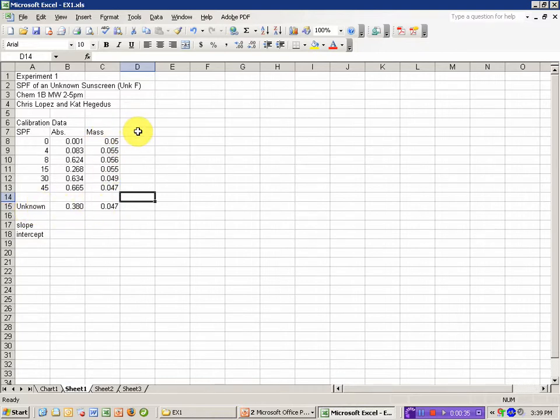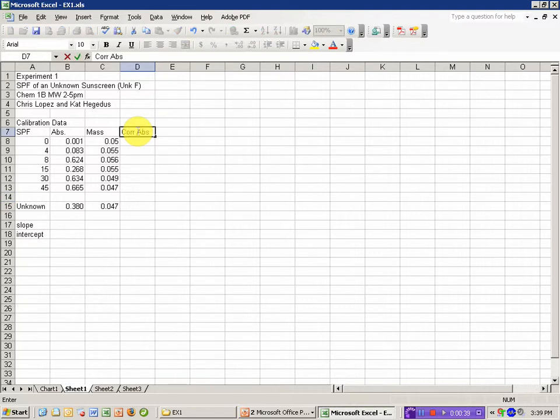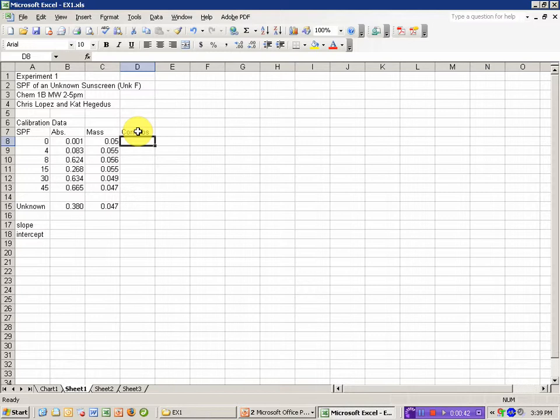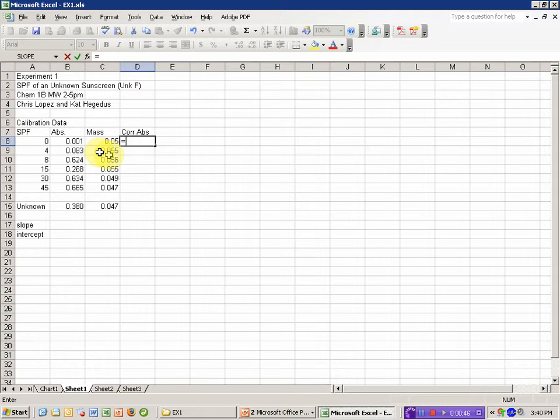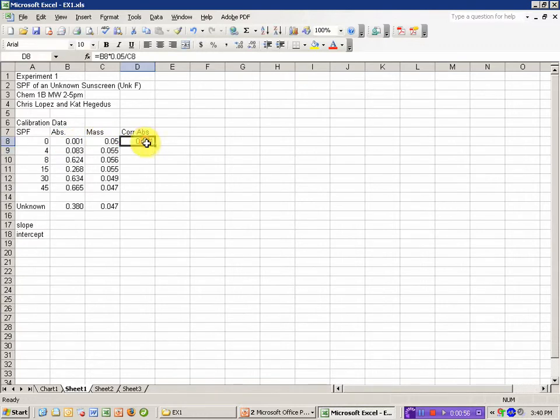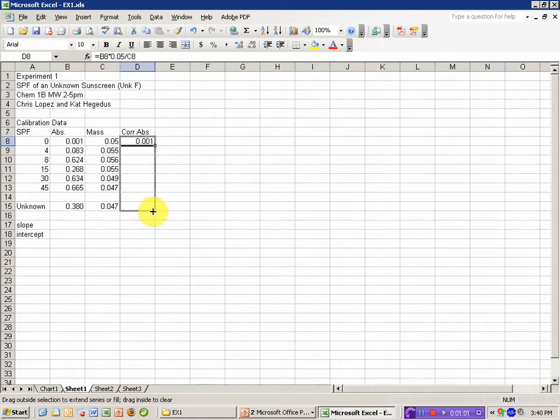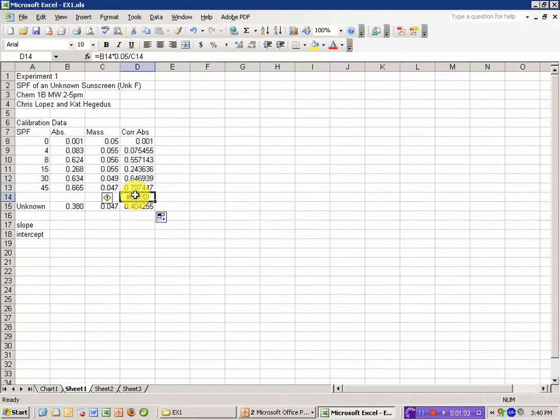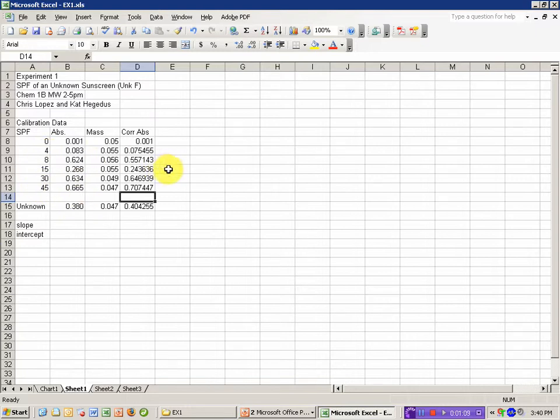I'm going to start by calculating the corrected absorbance. The corrected absorbance is a way to address the varying amounts of sunscreen used in each case. If you look in your lab manual, it tells you to calculate it as the absorbance times 0.05 divided by the mass of sunscreen used in grams. I can copy this down to other cells by clicking on this handle and just dragging down. I'll delete that extra value, and I've calculated the corrected absorbance for each of my standards as well as my unknown.